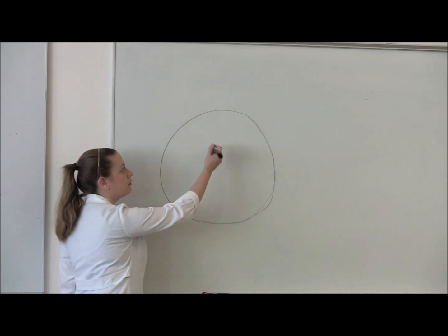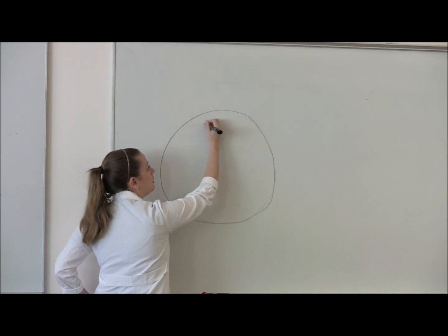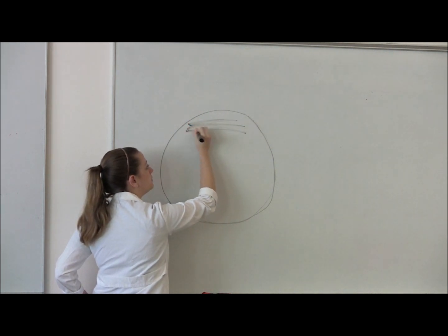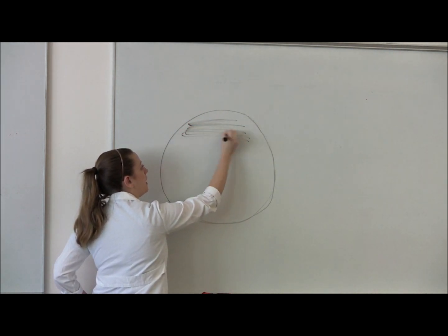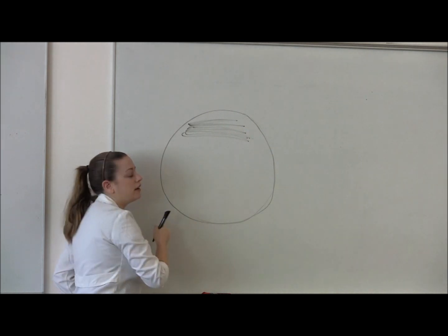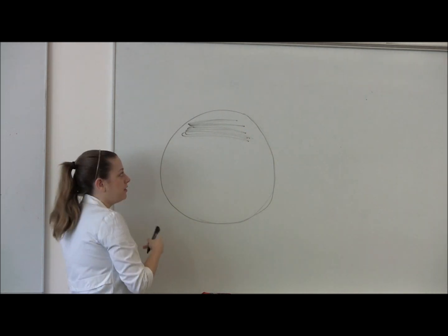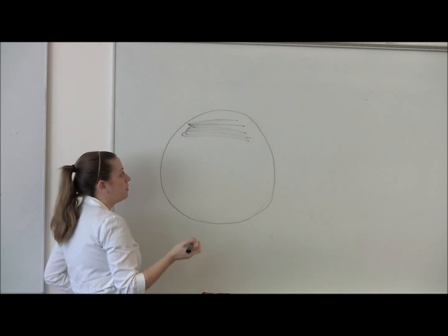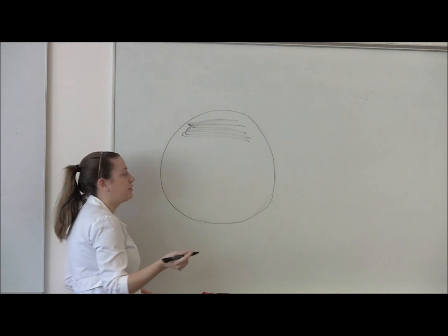Once you have bacteria on your loop, you're going to gently touch the loop to your first quadrant of your plate, and then spread the bacteria out in this first quadrant. After you do that, it's important that you flame your loop once again until the loop is red hot so that you get all of the bacteria off of the loop.